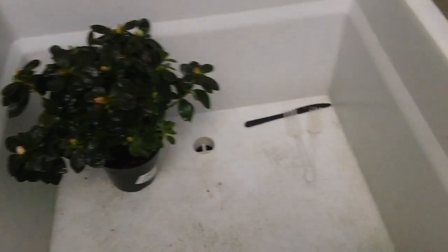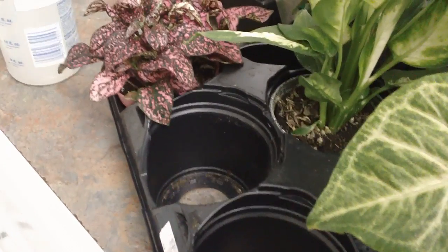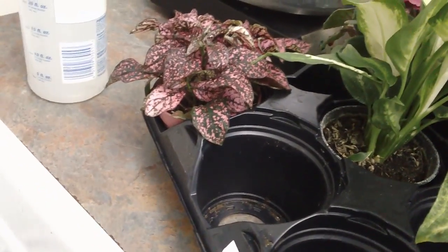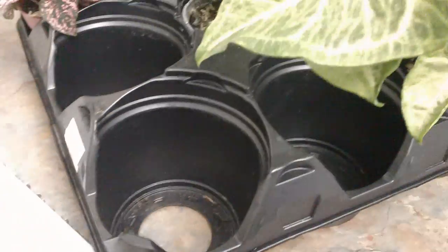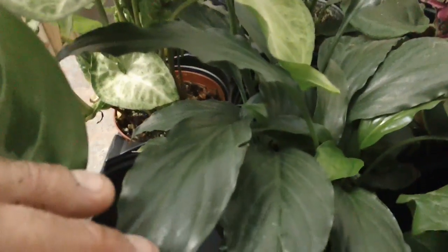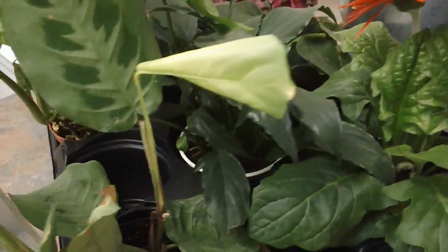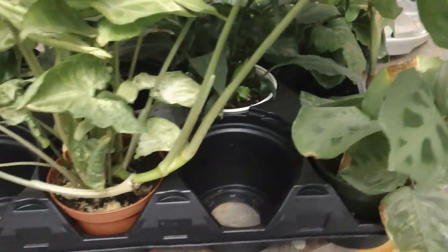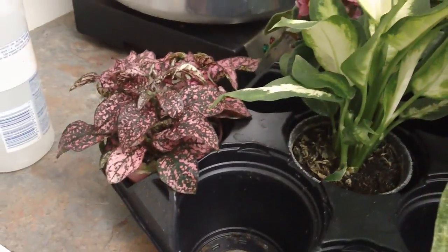After three weeks you should be able to put them together. Here's what I've got — a bunch of four-inch plants. All of these are plants from tissue culture, and we're going to put them back into tissue culture: polka dot plant, azalea, syngonium, Dieffenbachia, rosea picta, Gerber daisy, spath, and of course an African violet. These are the world's most successful foliage tissue culture crops.